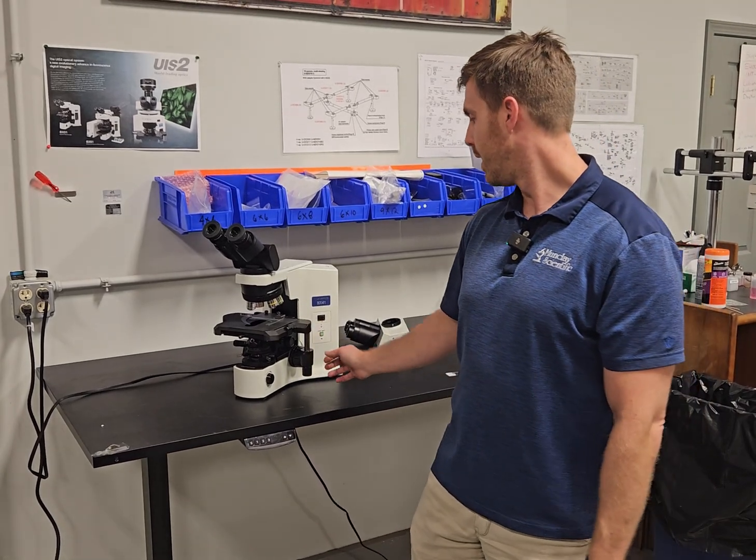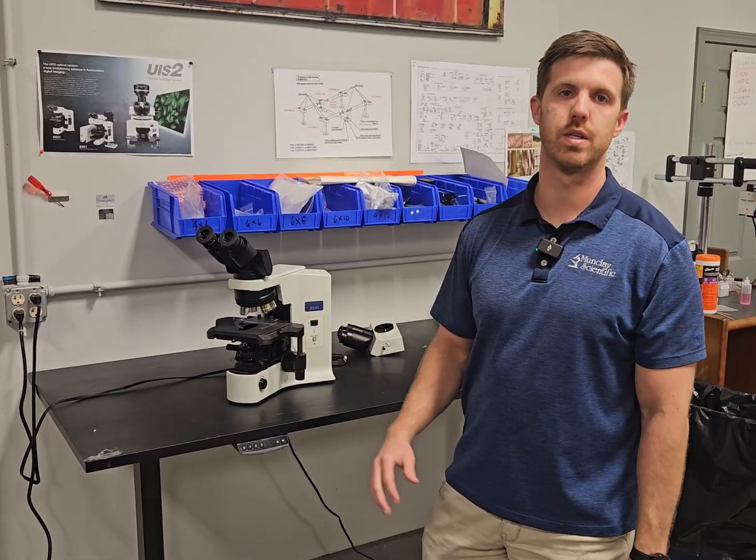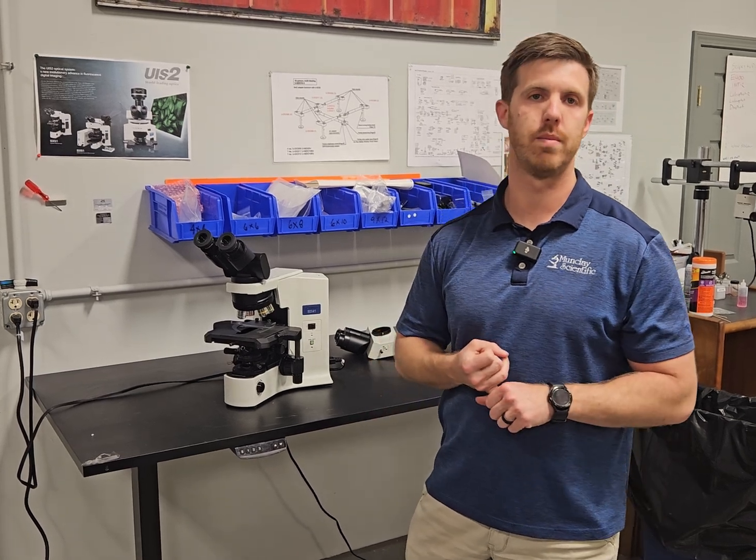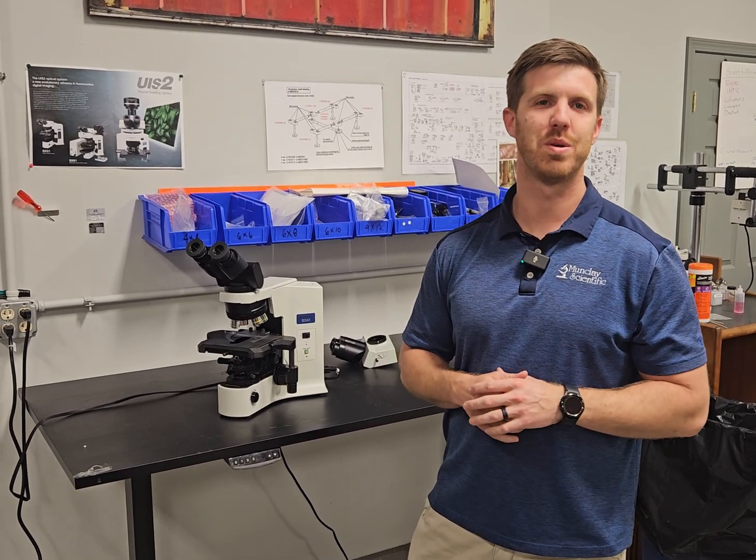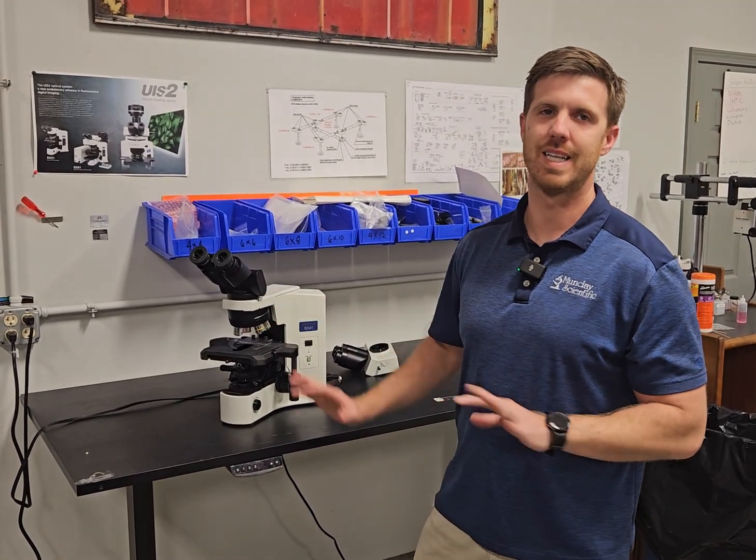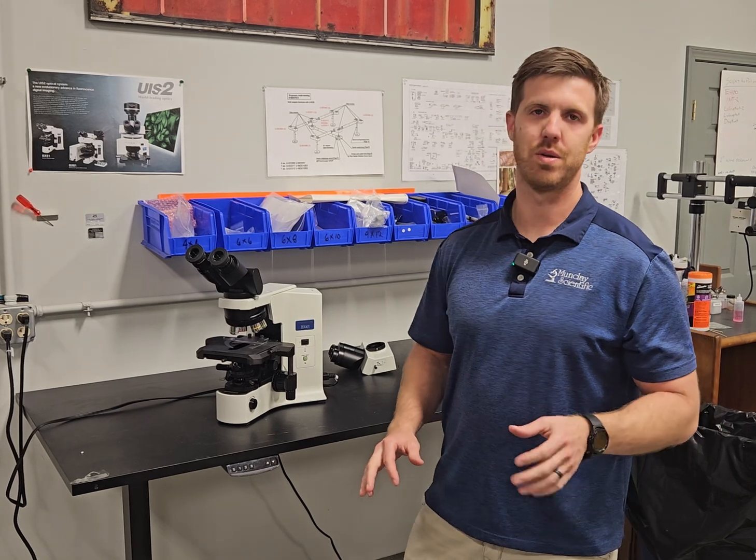I highly recommend it and they're priced around $5,000 for this configuration. So they're great for a new Mohs lab, any derm path, home pathology, clinical use in a hospital to upgrade. I would put this scope against anything, especially for clinical use.